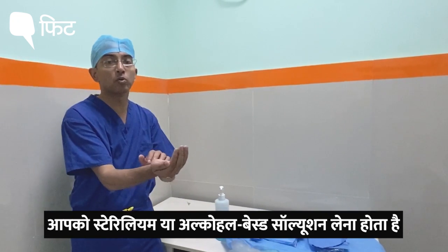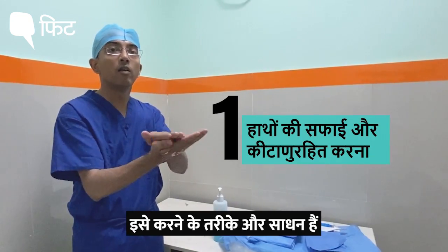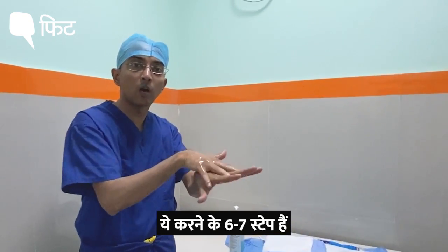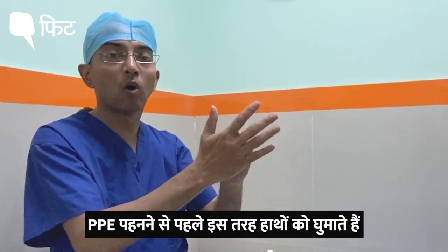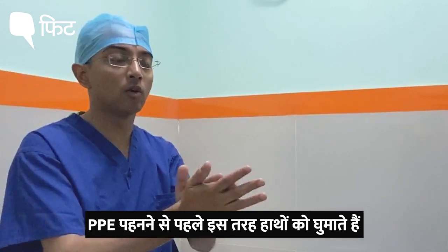You are supposed to take sterilium or an alcohol-based solution, and there are ways and means of doing this. There are six or seven steps on how to do this, and this is the first step — donning on and doffing off — before wearing your PPE.